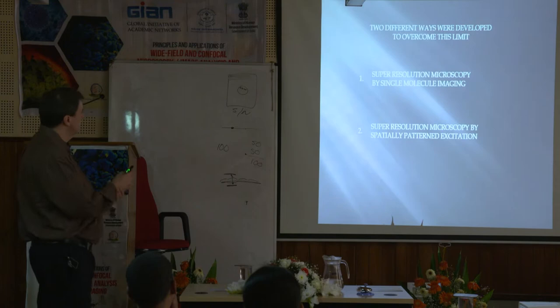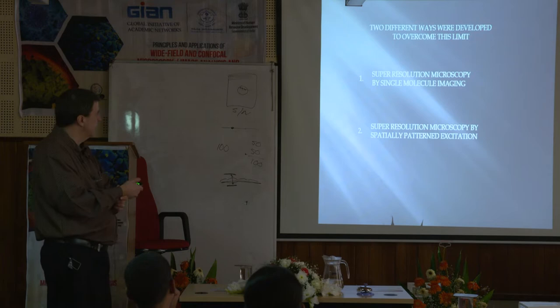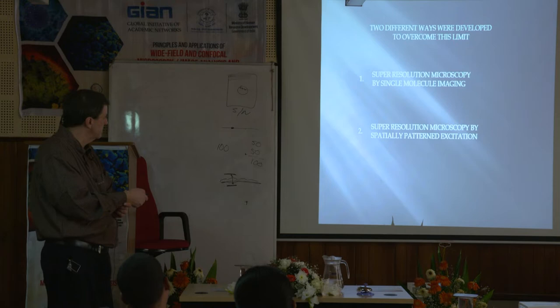Okay, so there were two different ways that came up with how to overcome this limit. One was super resolution by single molecule imaging, and the other one was super resolution by spatially patterned excitation. Okay, and we're going to get into these a little bit. Okay, so read this for a second.